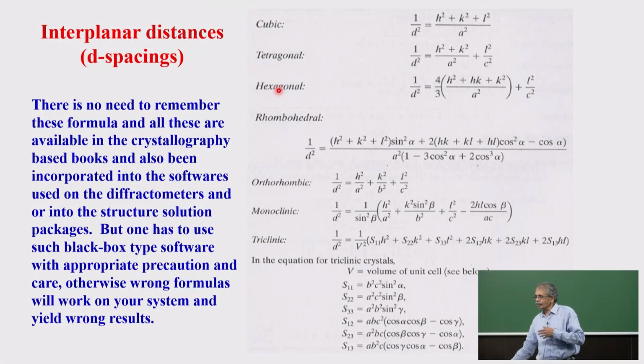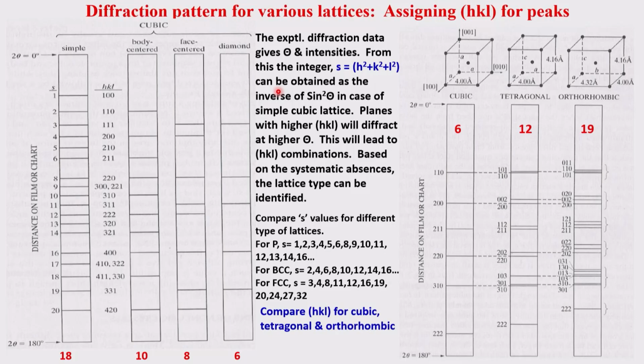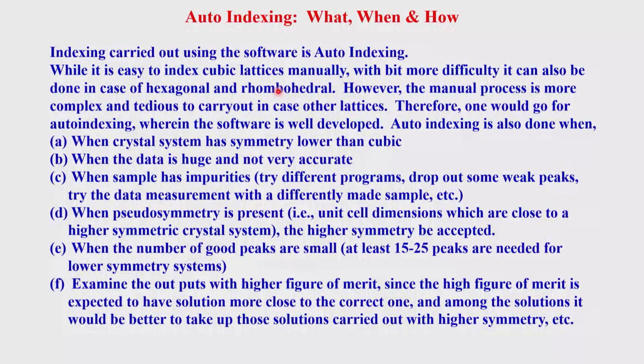Here you can see all the d, because you need to get the d. Without the d you can do nothing. So therefore a huge number of formulas are involved in all these things, and it becomes very laborious. You need too many iterations to get that minimal k value and those things. In principle it can be done, but it will be very tedious.